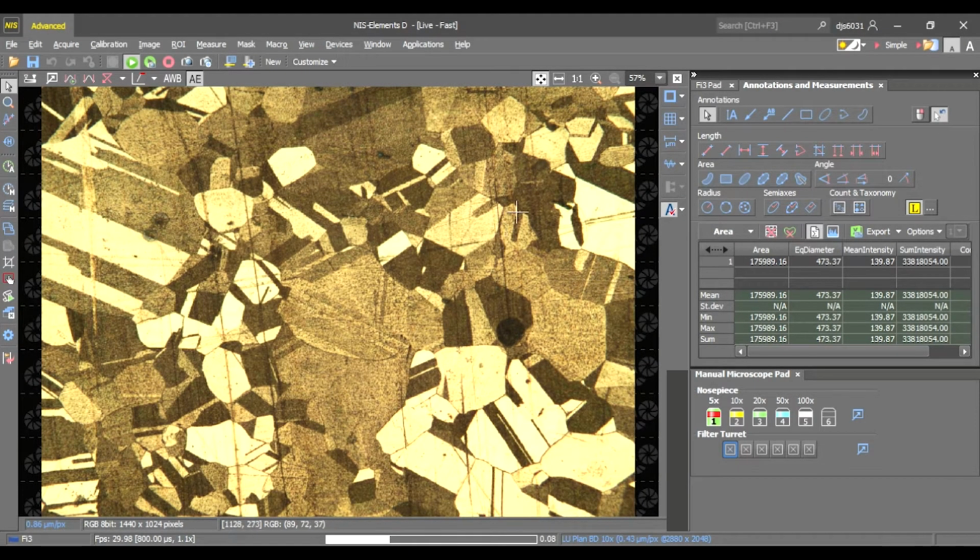So what I wanted to go over now is a couple extra features. One of the first features is this magnifying glass. If you click the magnifying glass, you can optically zoom in on different areas. I'm still working on it. I know there's a way to get it to stay on your image.